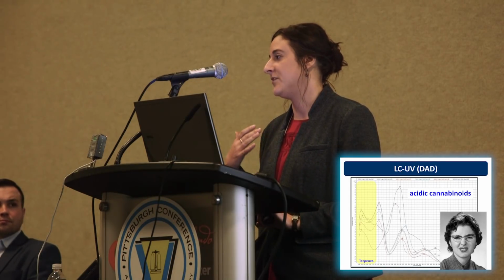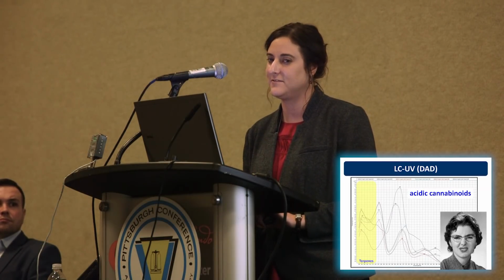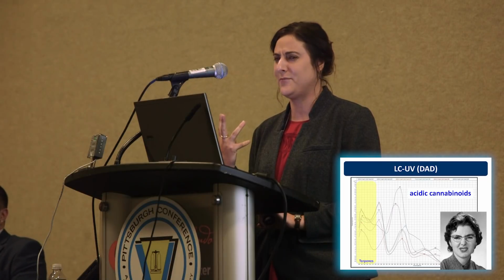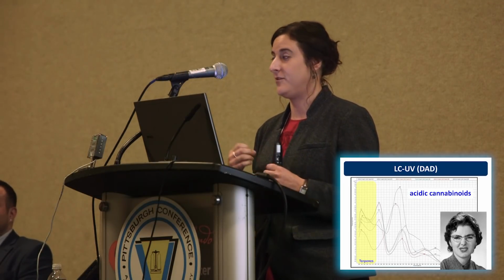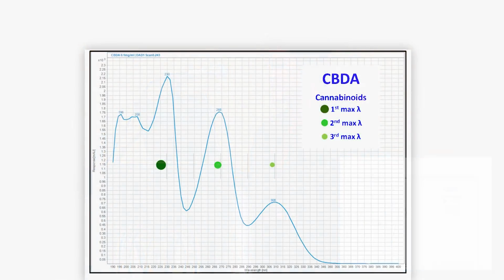So I'm going through this with terpenes, with cannabinoids, and I'm thinking, oh my gosh, there's a lot of other compounds in this extract. And really, I was like, I'm not going to be able to remember all these overlays and what to do. And what if I want to look back and say, wait, does this interfere with this, or what wavelength is this? So I came up with a system. I'm sure it's not anything super inventive, but for me, it's helpful graphically. Pictures are easy.